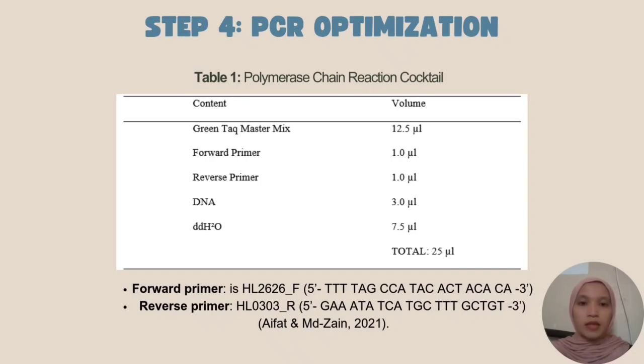So next is PCR amplification. During this research project, PCR optimization was also conducted in order to know the optimum temperature for annealing. The PCR optimization was done using this cocktail, and the forward and reverse primers as follows.